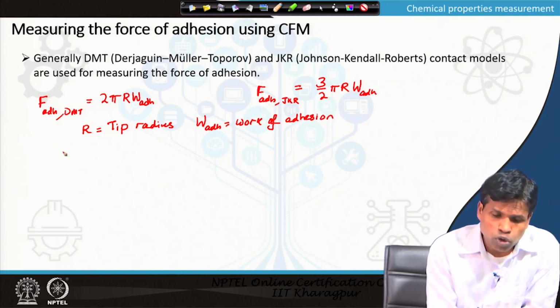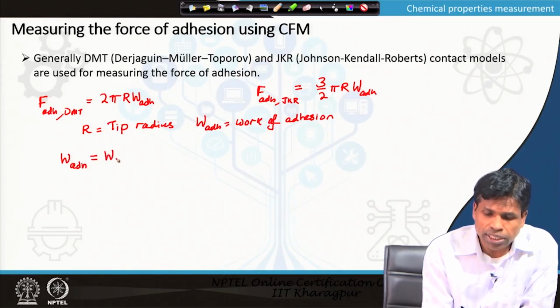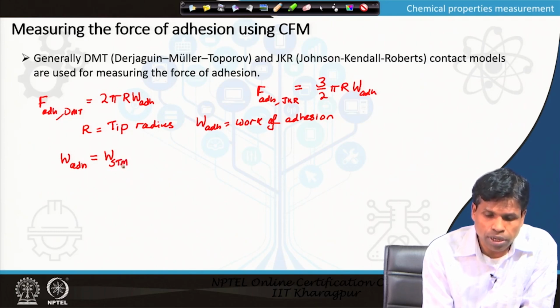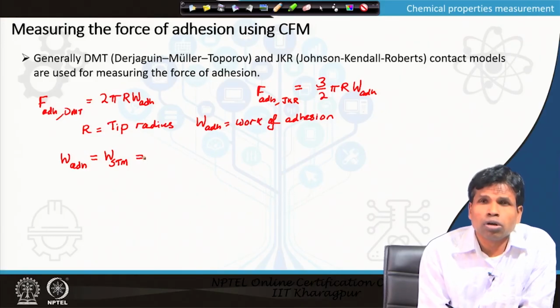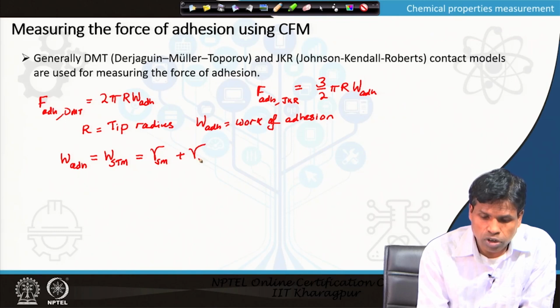Which is W adhesion, sometimes also written as W_STM, S for sample, T for tip, M for medium, which is equal to the interfacial energy or surface energy of sample and medium plus interfacial energy of tip and medium minus interfacial energy of sample and tip.